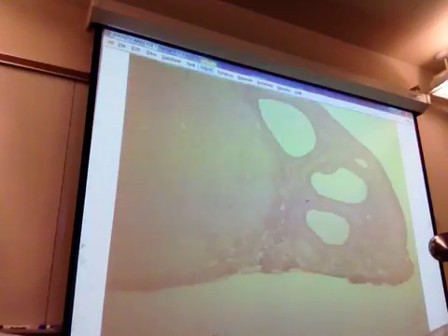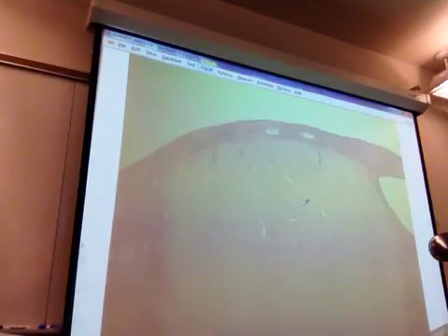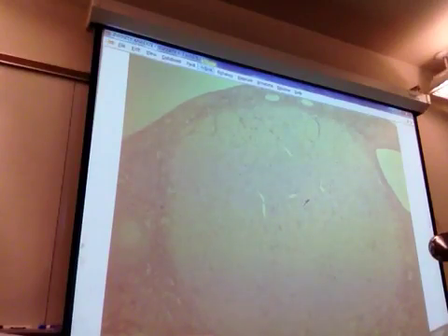Because see, if I can go all the way around, I've got an entire cross section of an ovary. You've got the capsule all the way around. Would it be much darker as well? It would be much darker. It would also look much more condensed. So you would see a lot more nuclei in a smaller space if it was an albicans.